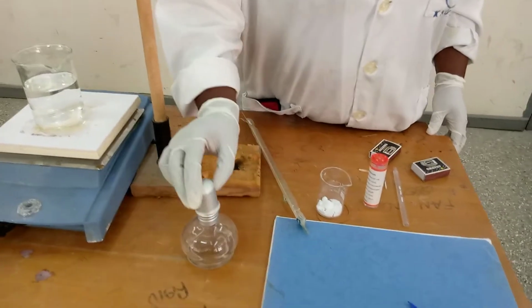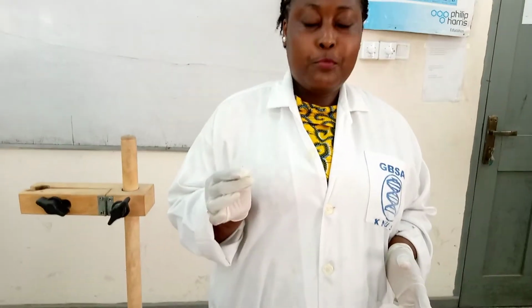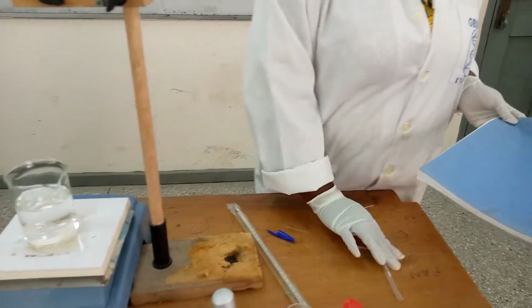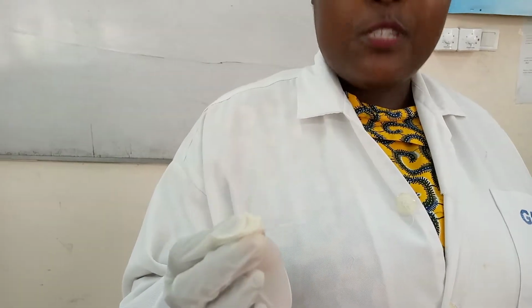Okay, now the next step is I'm going to fill my tube with the unknown sample. So let me demonstrate to you how you are going to fill it. So let me shift these ones at the back here. Okay, so I've already filled one of the capillary tubes with a sample. It's here. You can see that the tube contains some whitish substance. That is my unknown sample, but I want to demonstrate how to fill it.